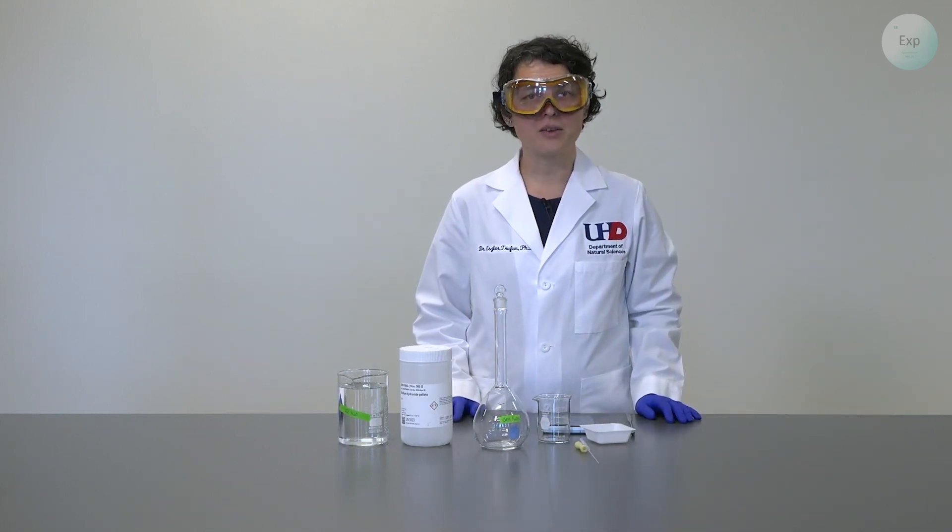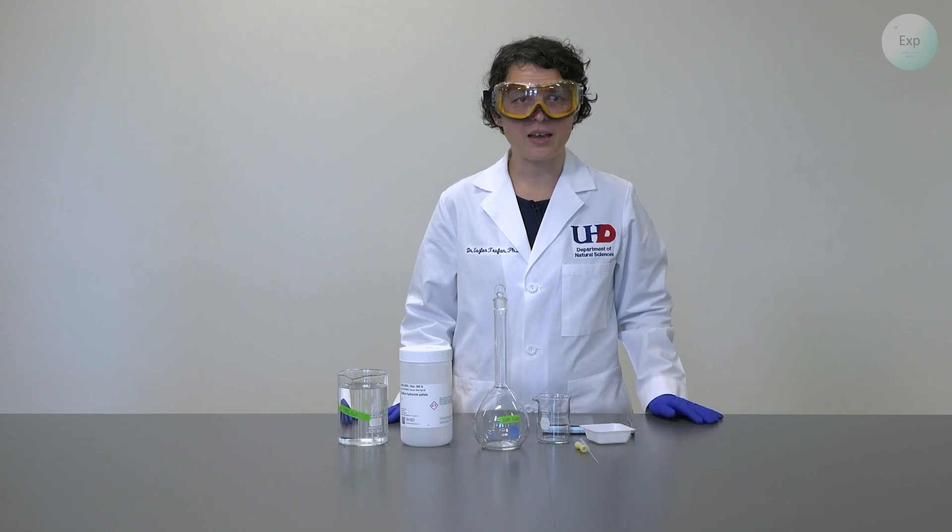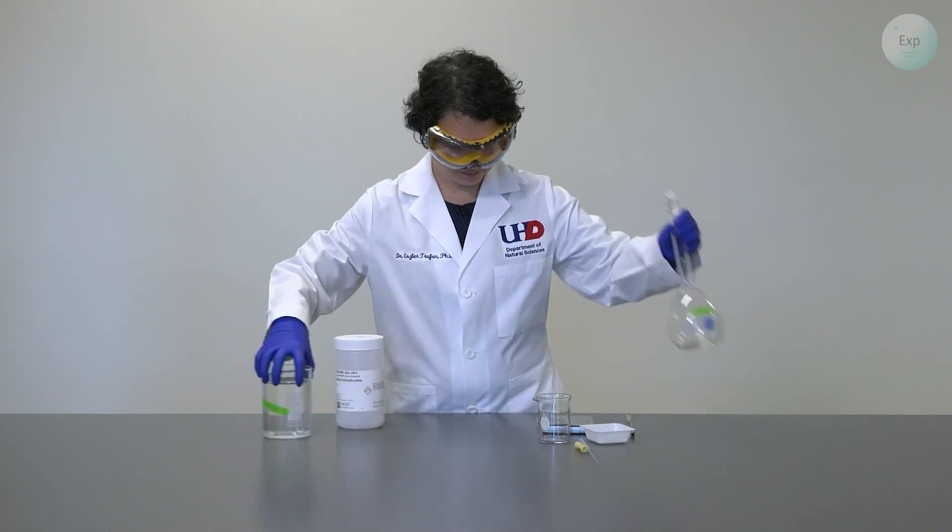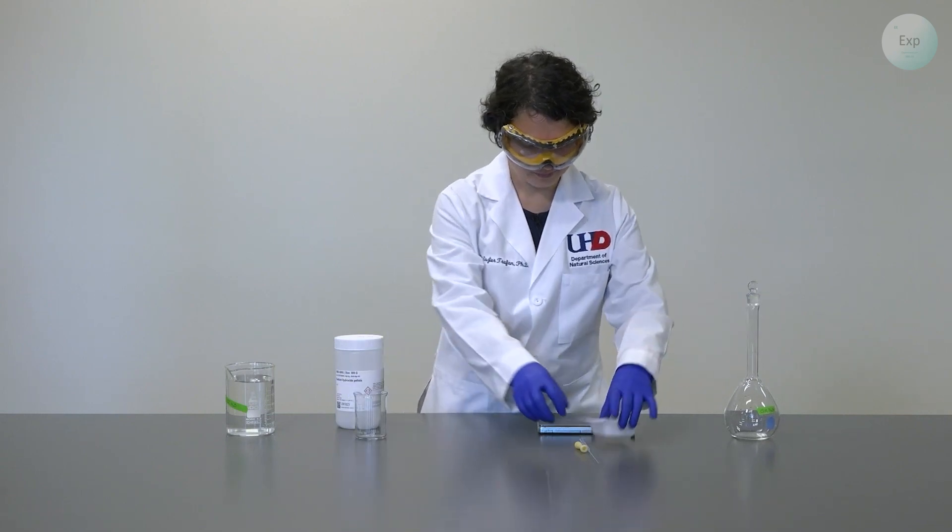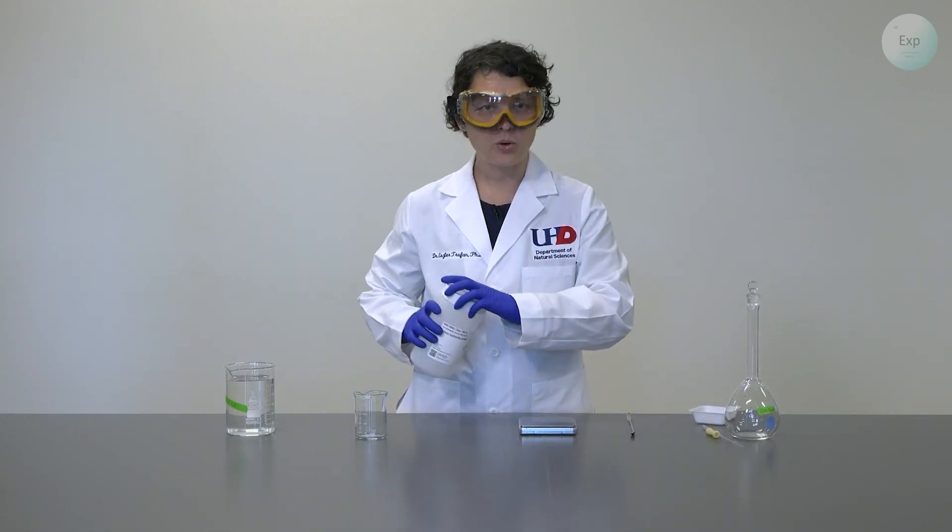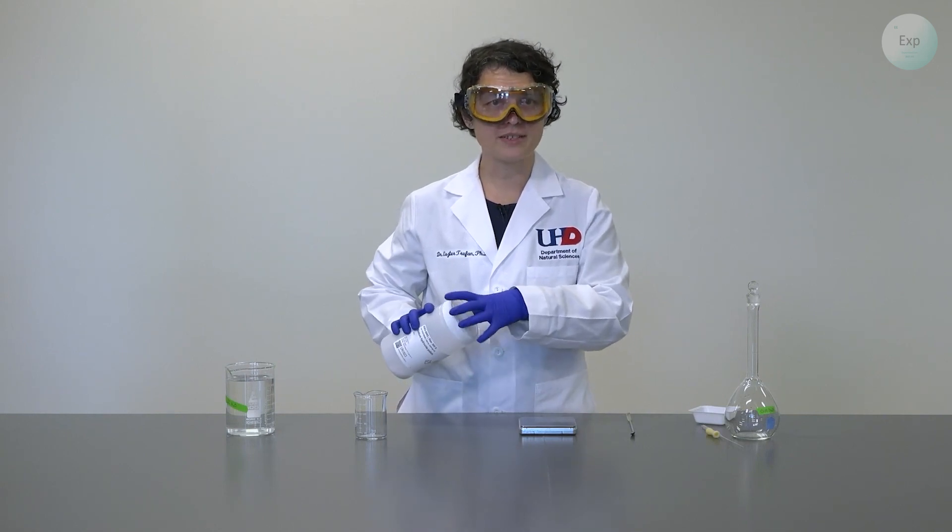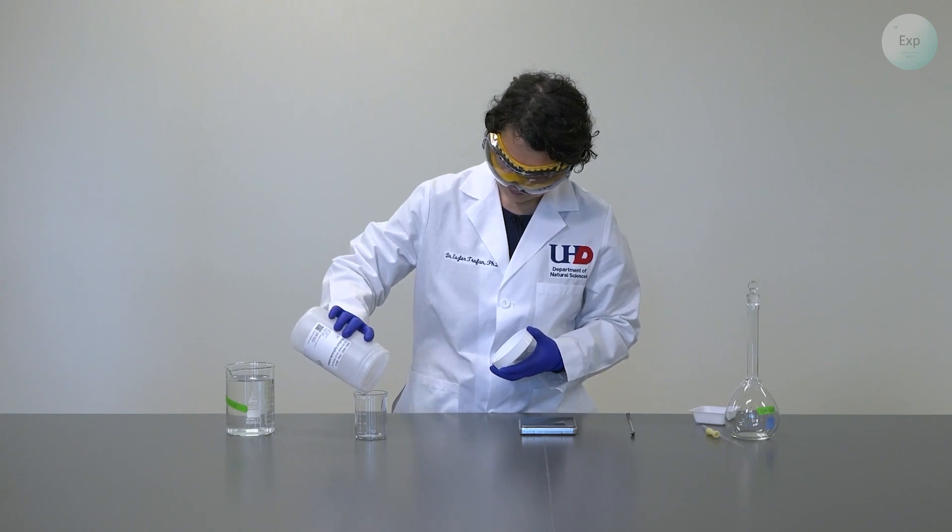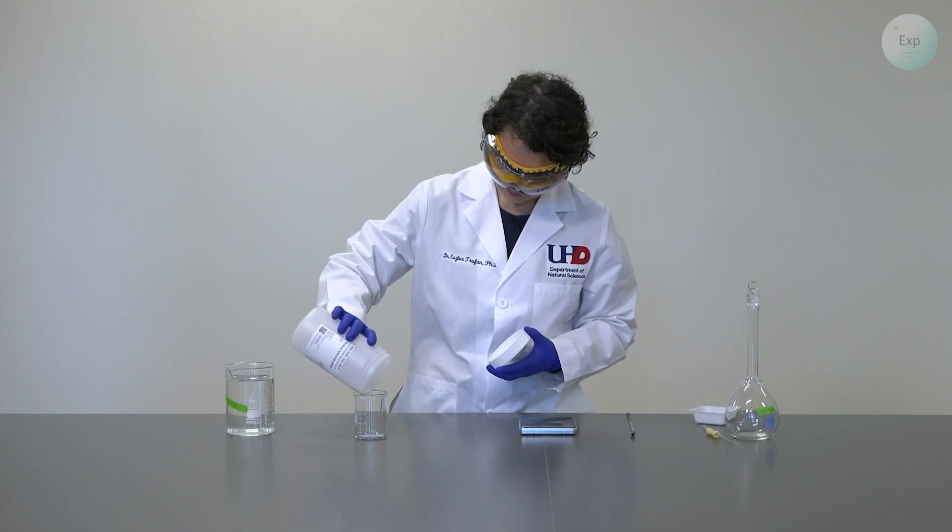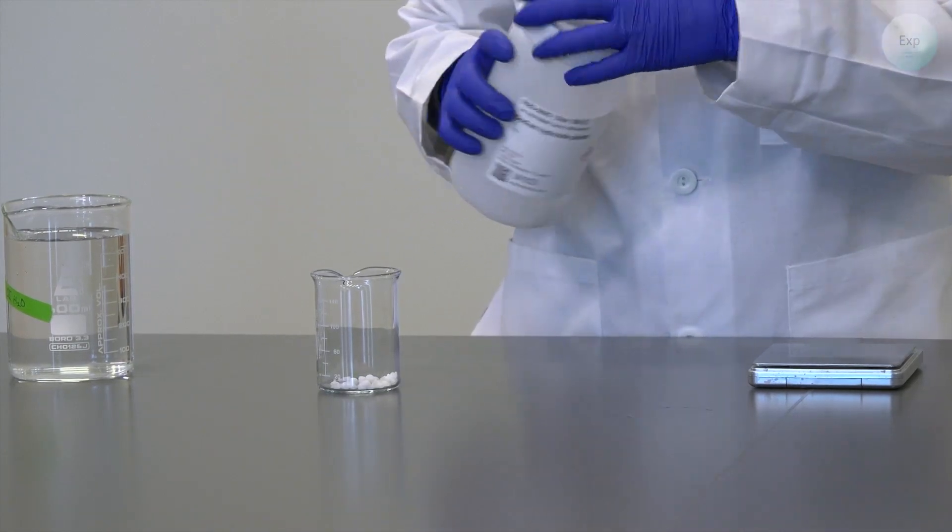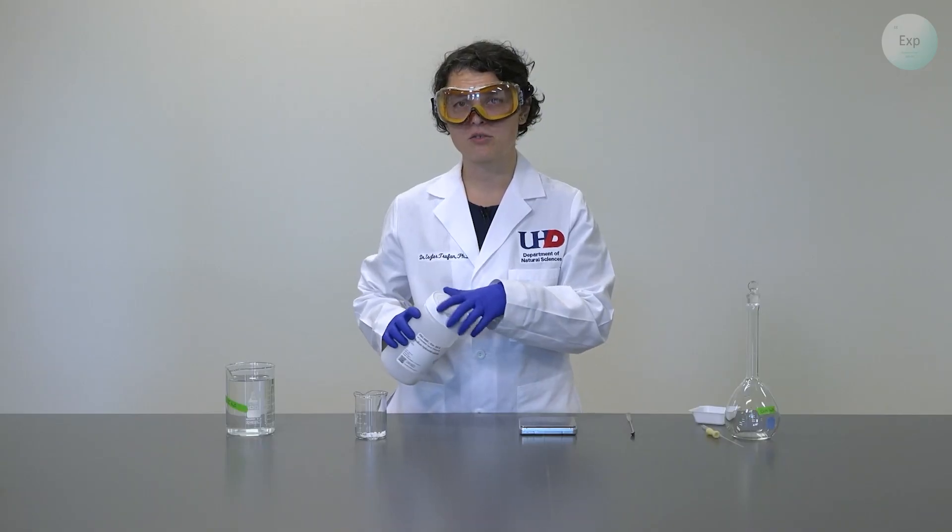So let's get started. The first thing that we're going to do is measure out two grams of the sodium hydroxide pellets. To do that, first, we open up our container and transfer a small amount of sodium hydroxide pellets into a secondary container. We want to be rather quick with this because sodium hydroxide is a hygroscopic material.